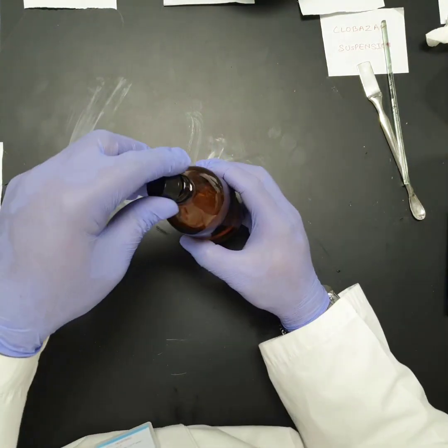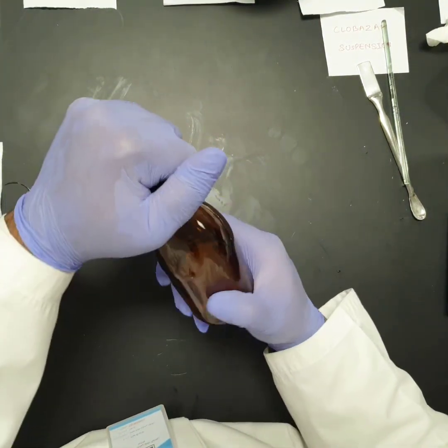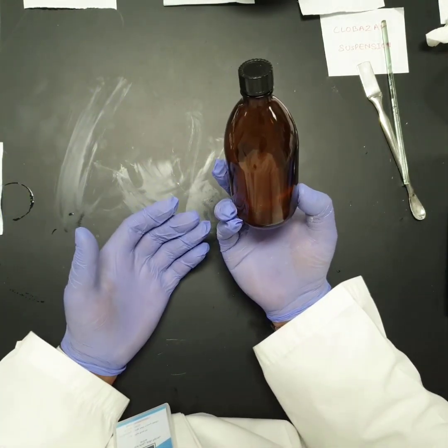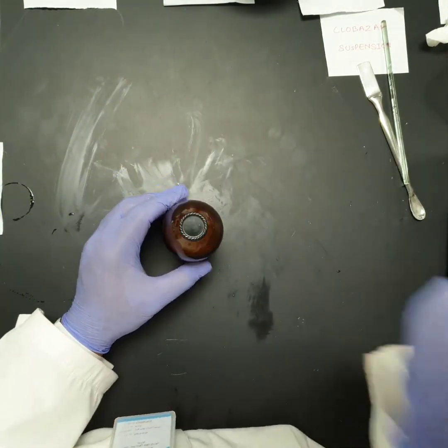As you can see, this is our final product of Clobazam suspension, and it is ready to label now, and we can dispense it. Thank you very much.